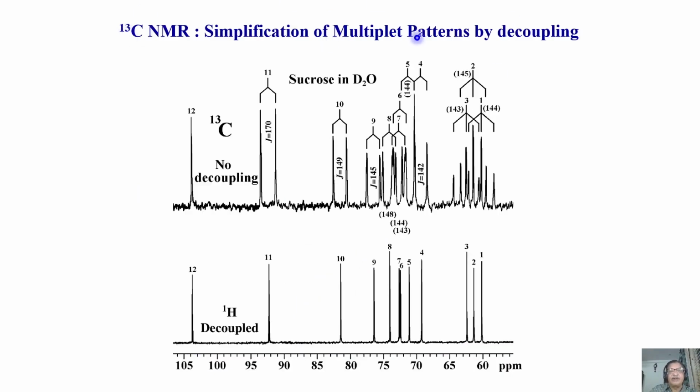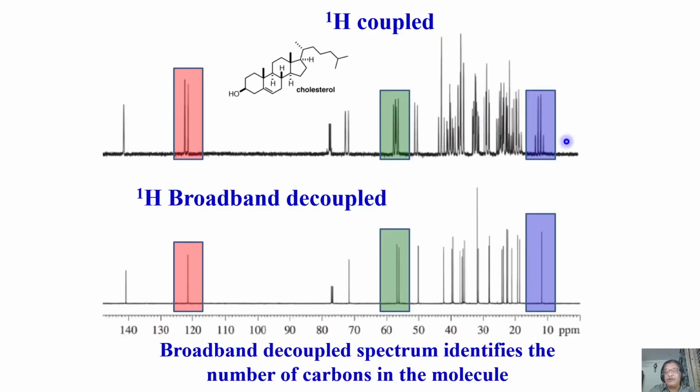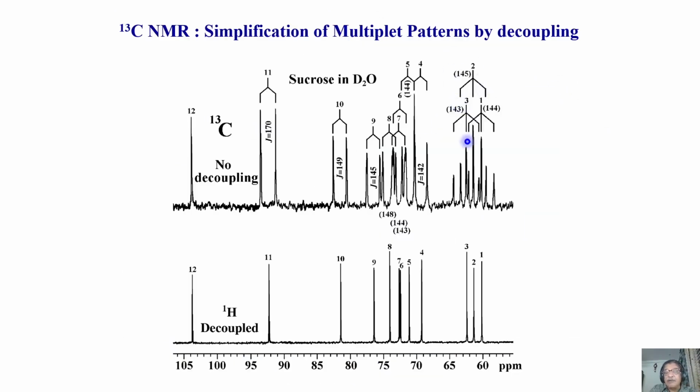So as an example, you can see how complex the multiplicity pattern sometimes is. In the previous example, you knew these were all identifiable doublets and quartets. Consider a situation like this. Here the triplet is overlapped. It is not an easily identifiable triplet. One of the peaks of the triplet comes here, one comes here, and another comes here. They are all crossed over to different regions. Peaks are not clearly identifiable.